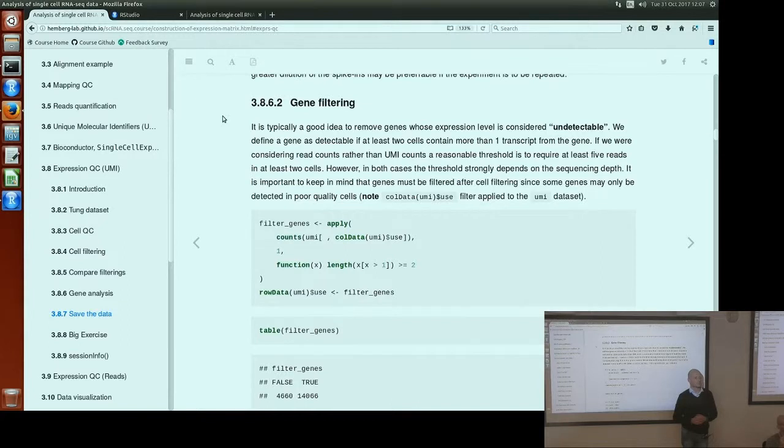So I would think very carefully about the experimental design before doing a single-cell experiment where it was crucial to be picking up lowly expressed genes. Unless the reason is that the gene is lowly expressed in your bulk because the cell type is rare, but if you know or suspect that it could be highly expressed in a low number of cells, then of course it would be meaningful to do it for that reason. But then it's no longer lowly expressed by definition. Yeah. So if the gene is expressed in 5% of the cells but highly expressed, then it makes sense. If it's very lowly expressed, it's not. It's probably an error in the expression.